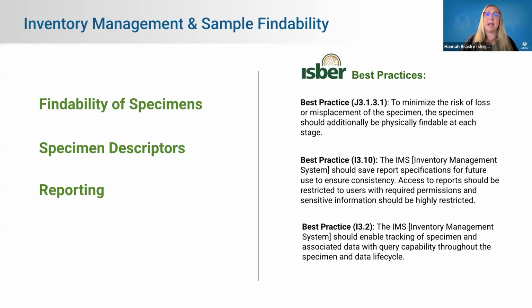And then the last thing is around reporting, which allows the inventory management system, or the IMS, as ISBER refers to it, to make sure that the tracking of specimen and data has that query capability throughout the specimen and data lifecycle. So again, just making it easier for biobanks to retrieve the information about samples as well as the location of samples as they're going through their daily processes.